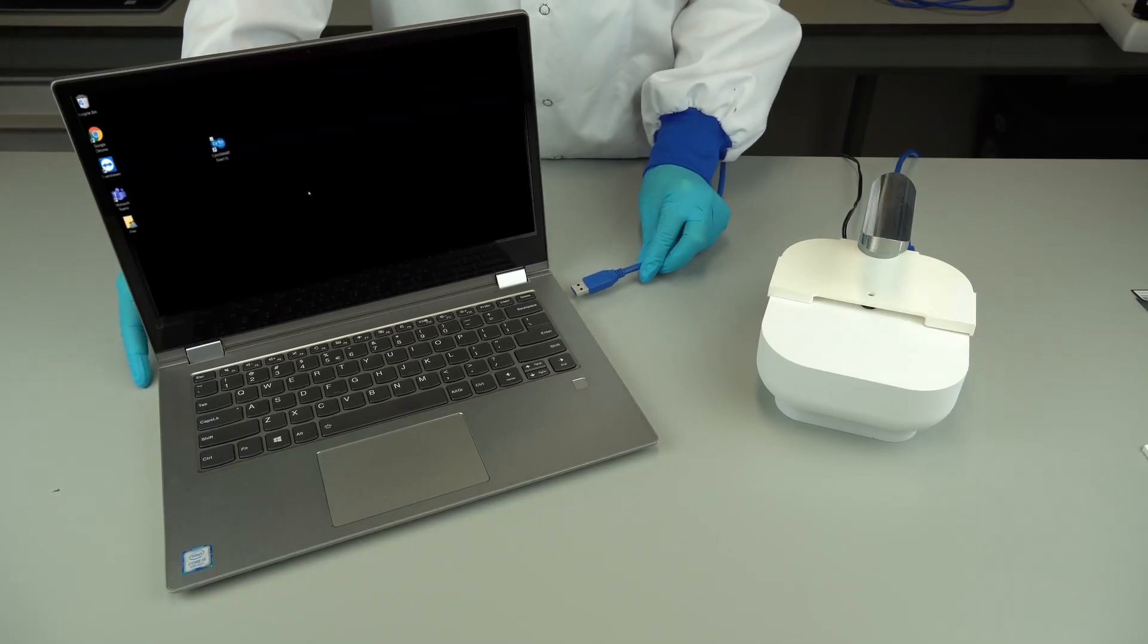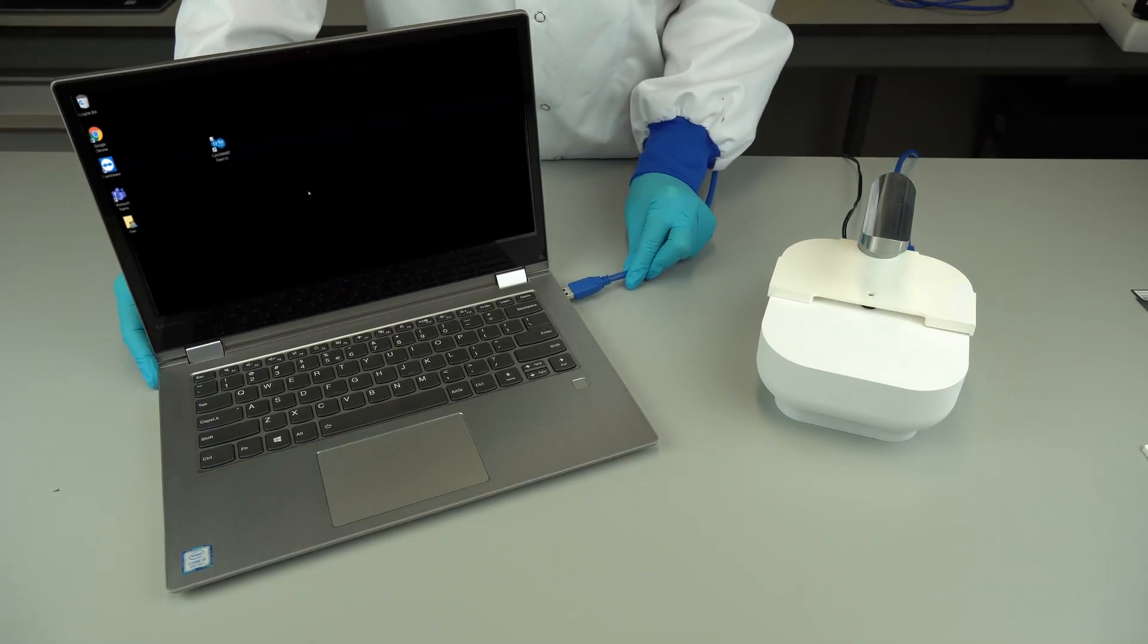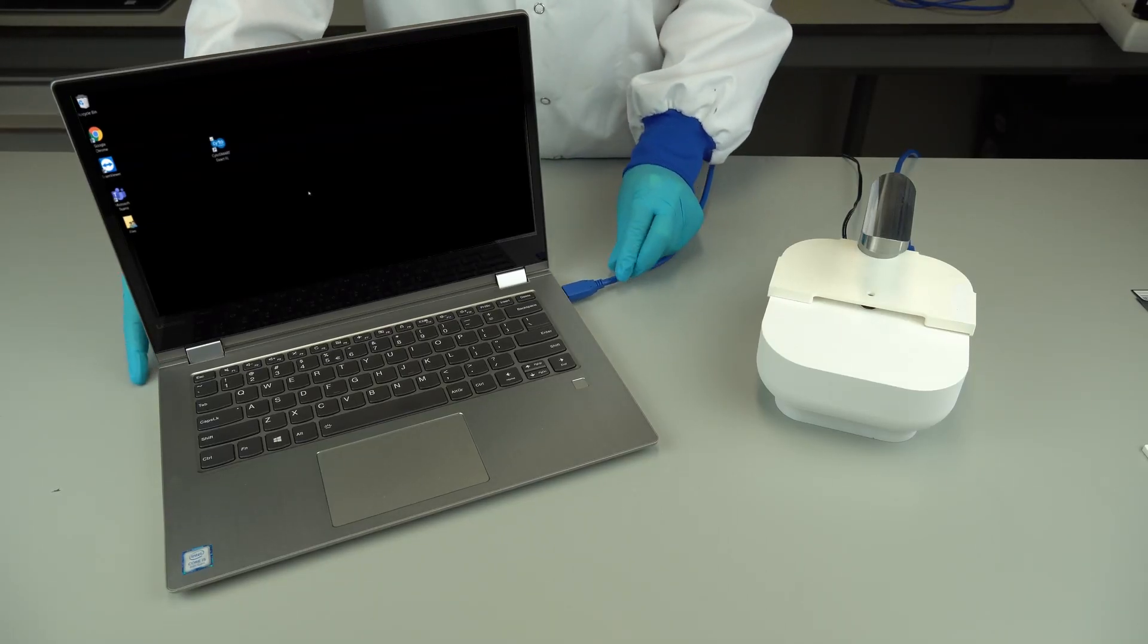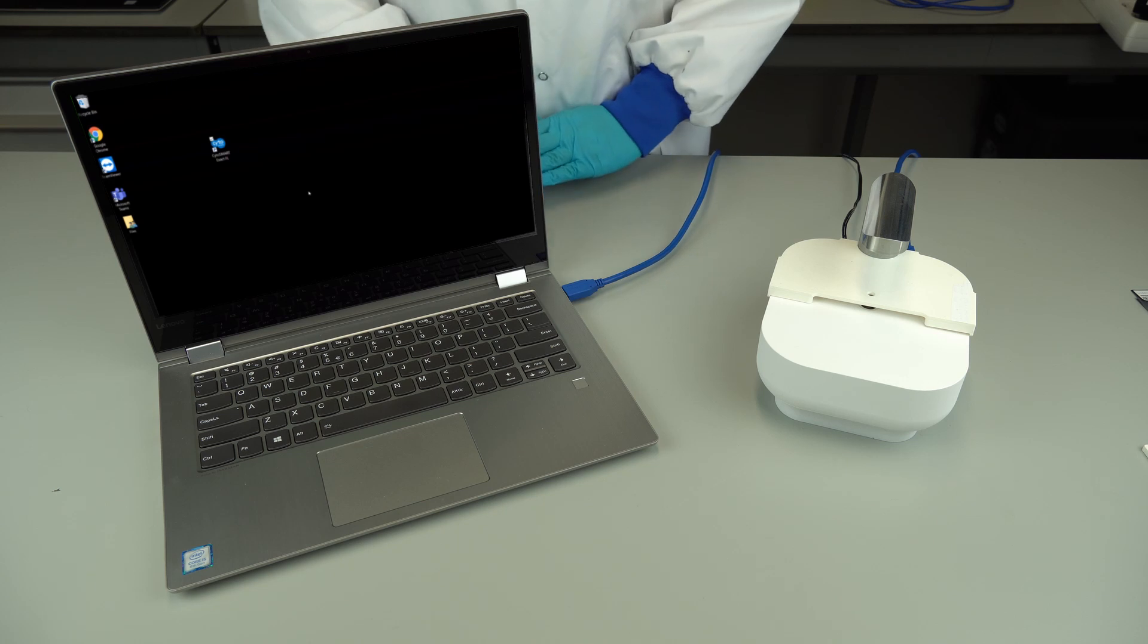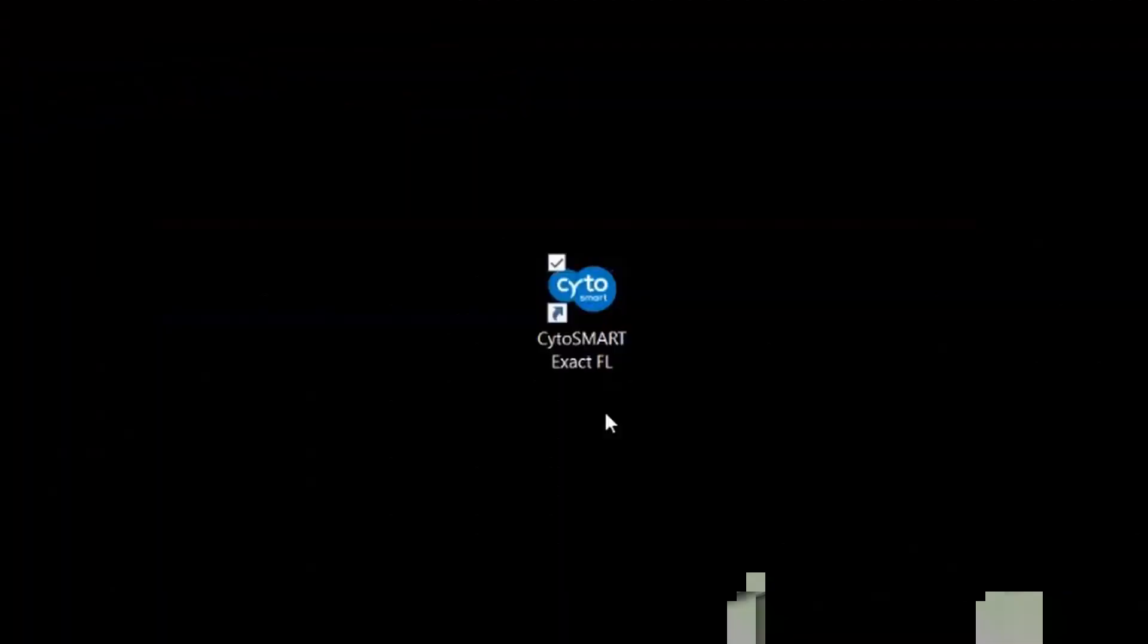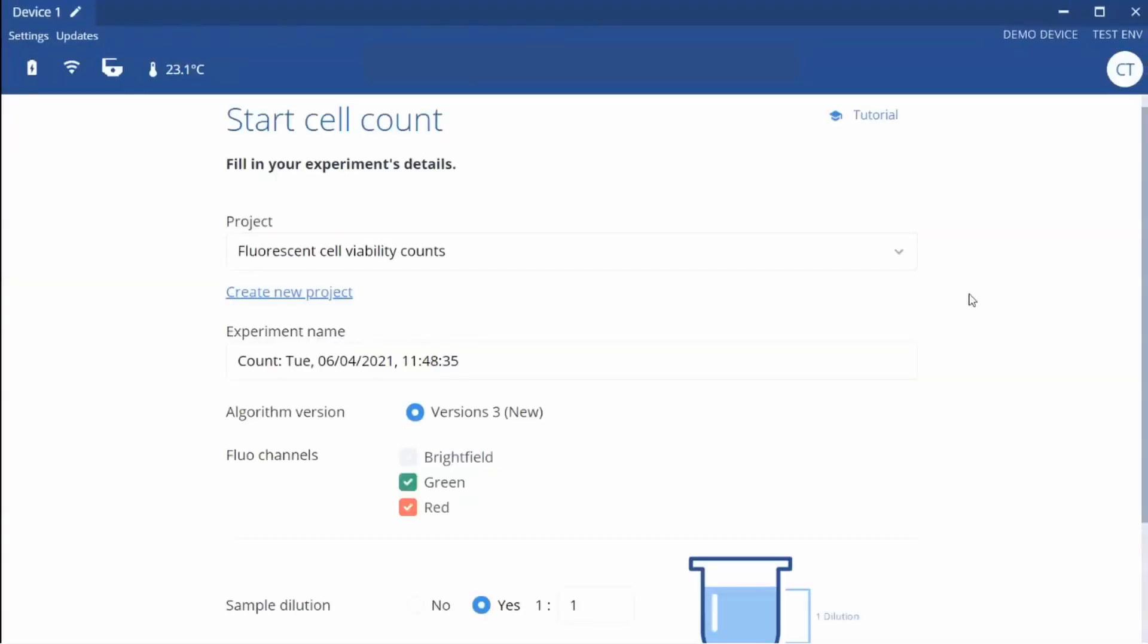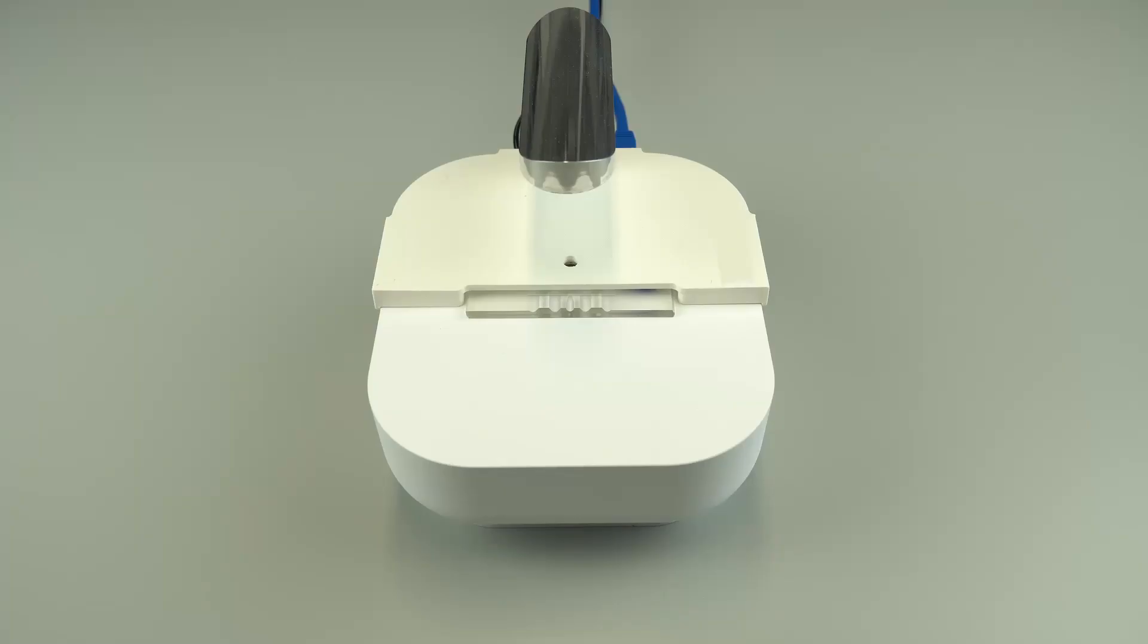Connect the Cytosmart ExactFL to the laptop using a USB 3 port. Open the Cytosmart application. A green light will appear on the device.